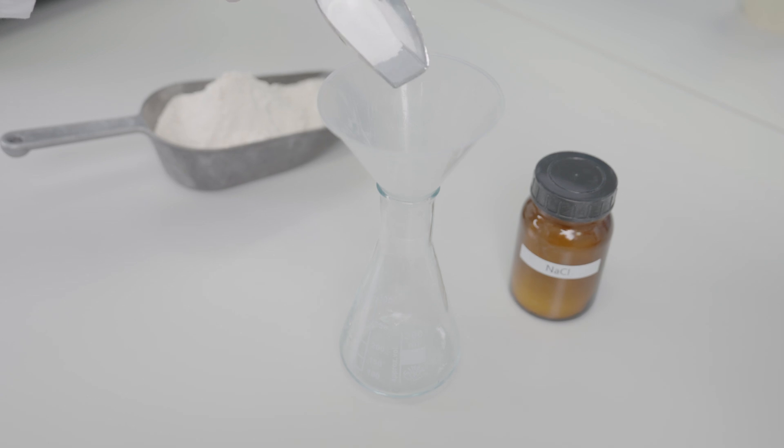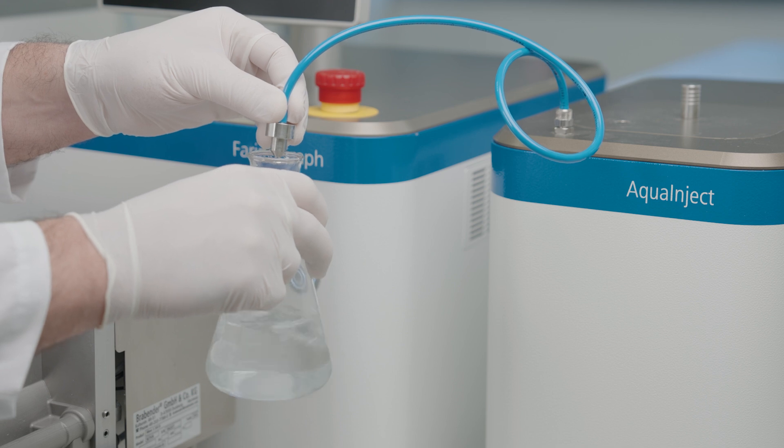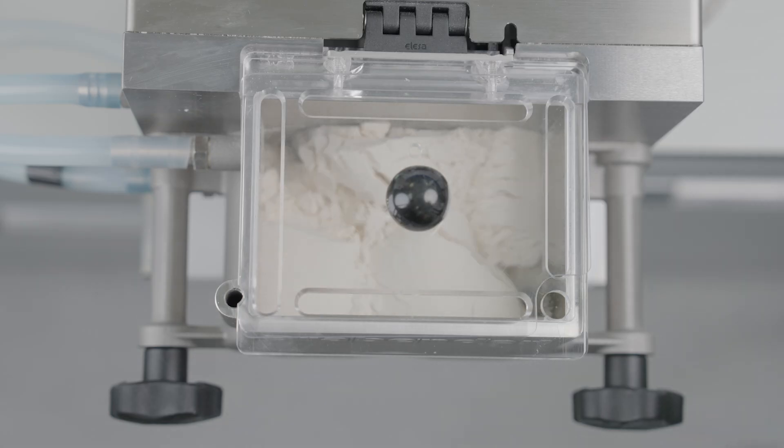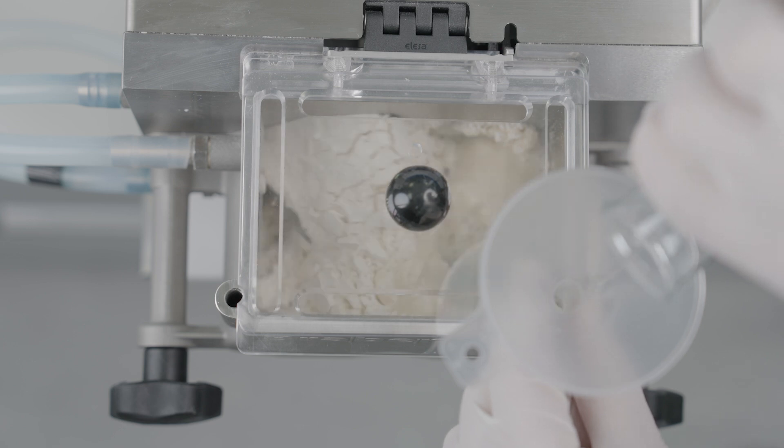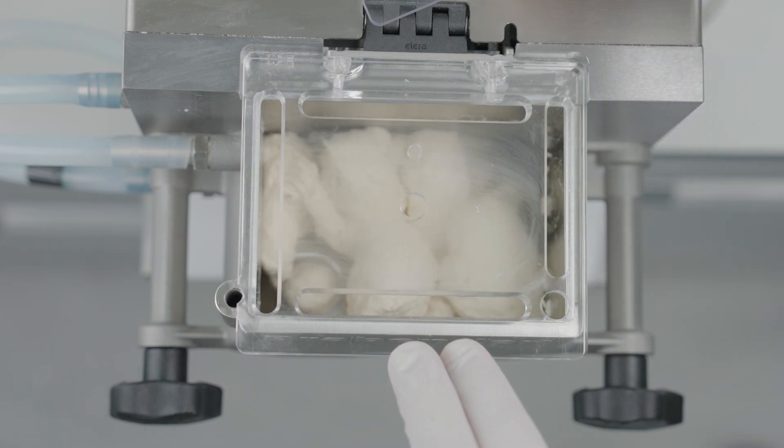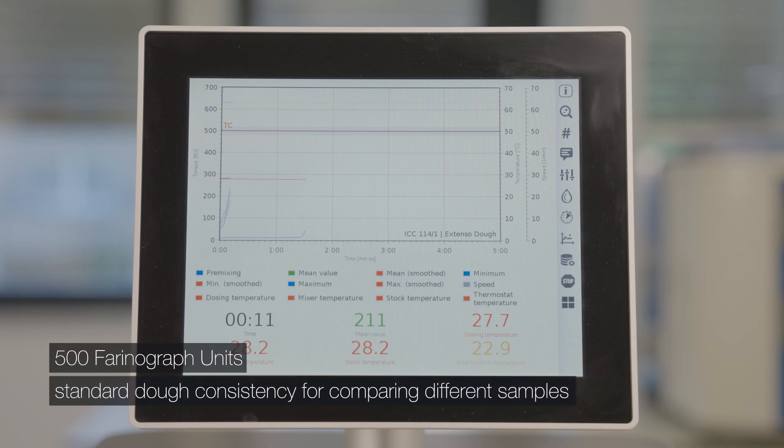Weigh out 6 grams of salt and add it to the beaker. Let the aqua inject dose the water to the beaker and create a water salt solution. After pre-mixing, add the salt solution within 25 seconds to the mixer. Scrape down the dough residues and close the lid with plexiglass plate. After five minutes, the consistency should be at 500 farinograph units.